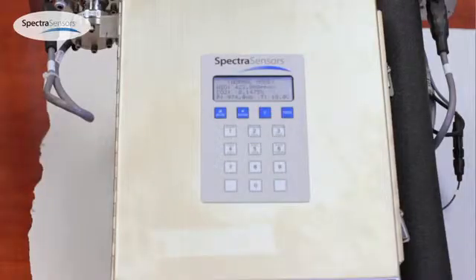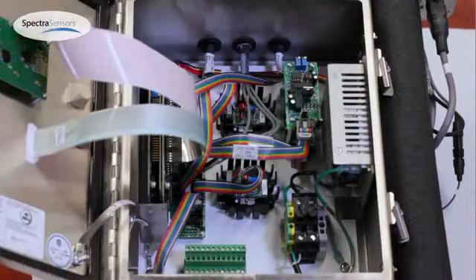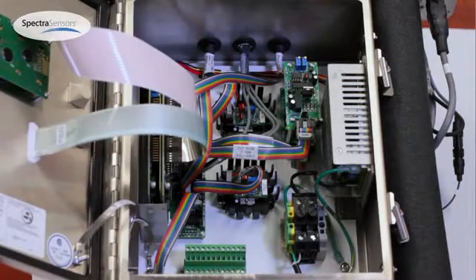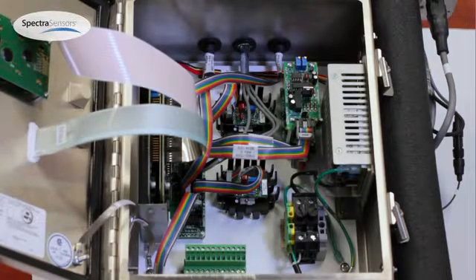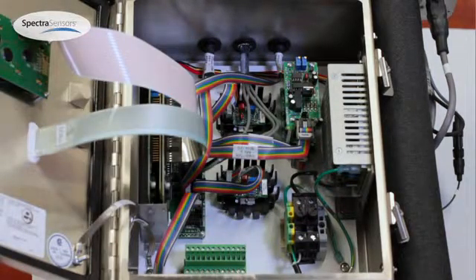For the SS3000, the data connection for the channel A is identical that we showed on the SS2000. For this, I'll show the channel B connection.